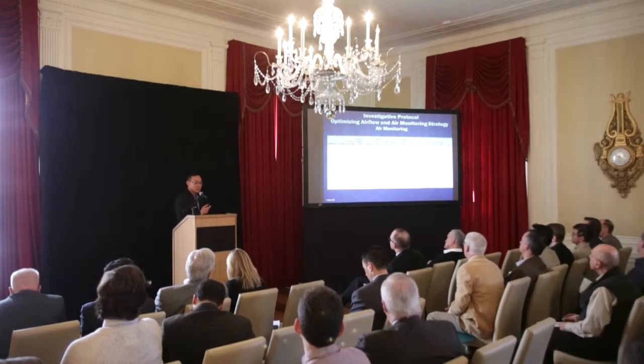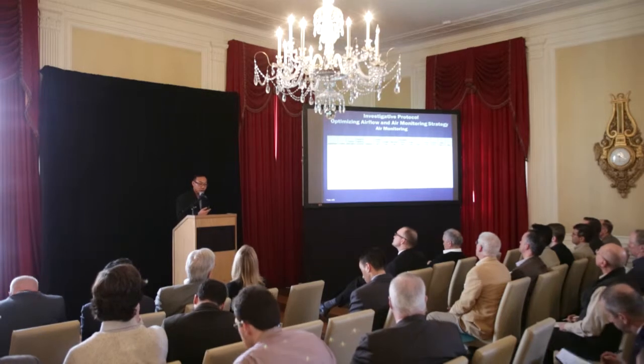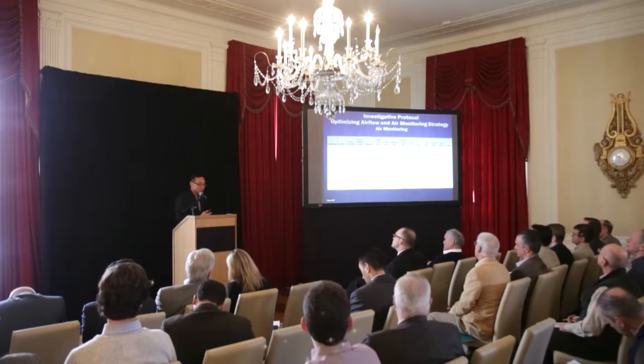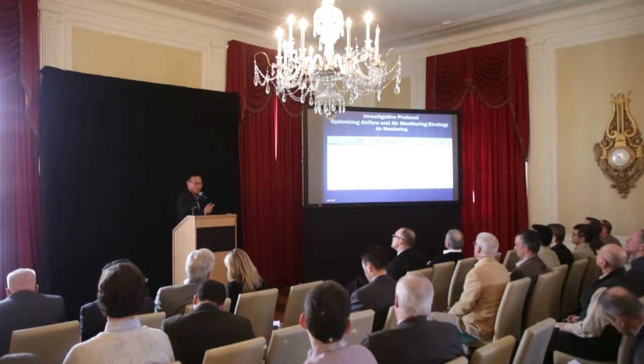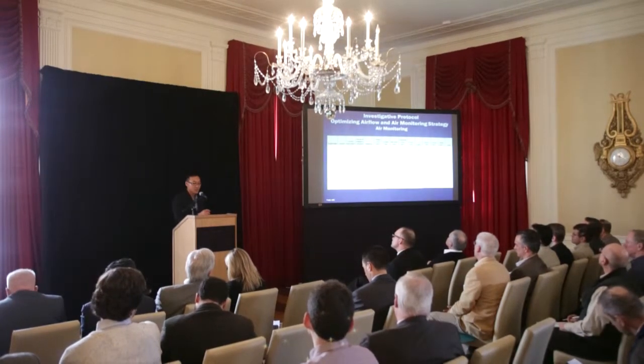And also, we're maintaining a database of exposure monitoring in all of our labs. That's initiated by many different reasons: benchtop assessments, indoor air quality complaints, special directives from Cal OSHA, or programs where we're trying to monitor for carcinogens and that sort of thing.